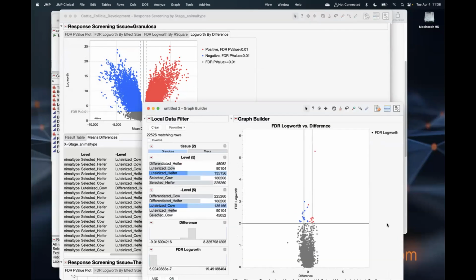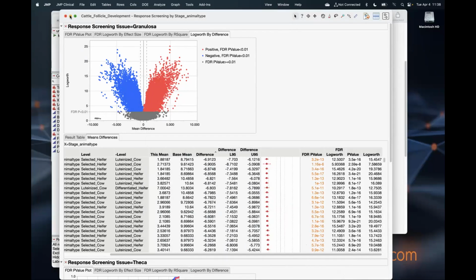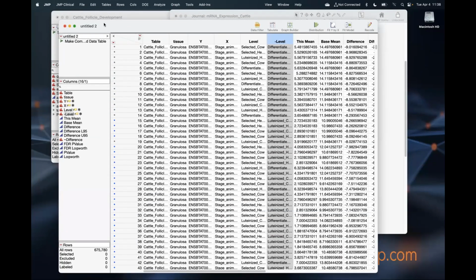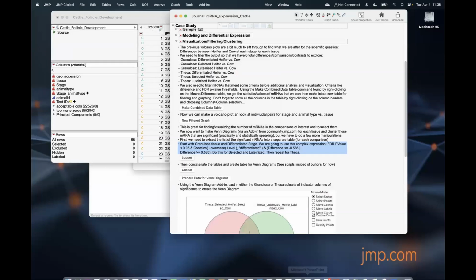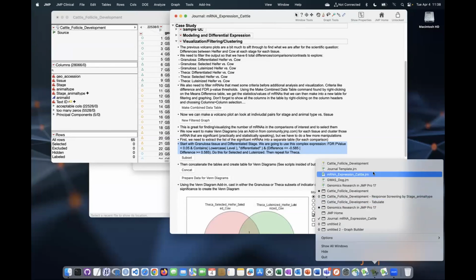So I've done that. I'm going to move some of these things. Let me minimize this, minimize that. So what happens if I do that? It would help if I don't have this one. There we go. That's my mistake. I've combined this table too many times.